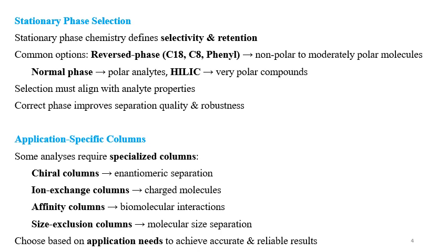What type of HPLC method you are developing will give you some information for the selection of the stationary phase. Your options may be normal phase HPLC or RP HPLC.